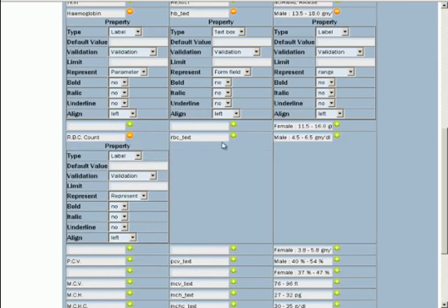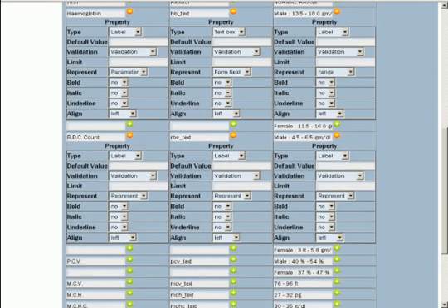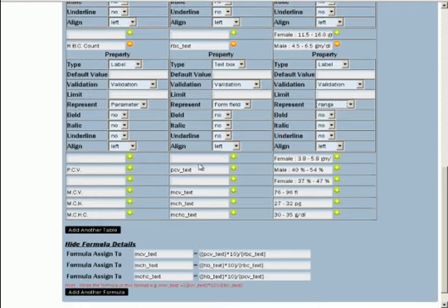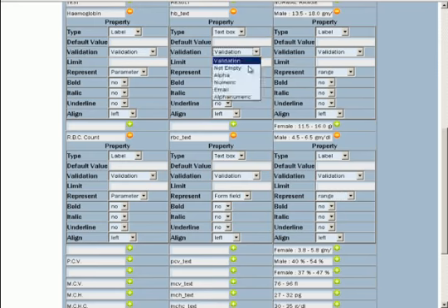For example, you can enter the type, whether it's a label, text box, text area, or drop down. What is the default value for each, in case you need it to be defined? Is there any validation on any of these fields? For example, a validation whether it's numeric, only alphanumeric, only numeric characters, etc. Also, the limit is to be defined.